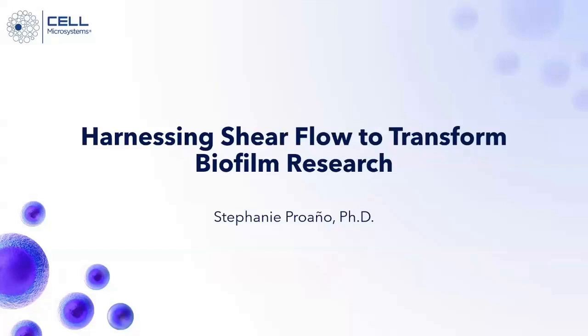That is a great question. Most of what's in the literature is early or preclinical research. So that would be pretty much where the realm of the Bioflux is.